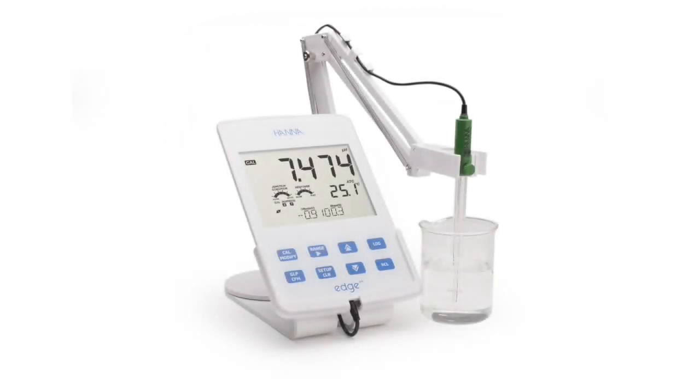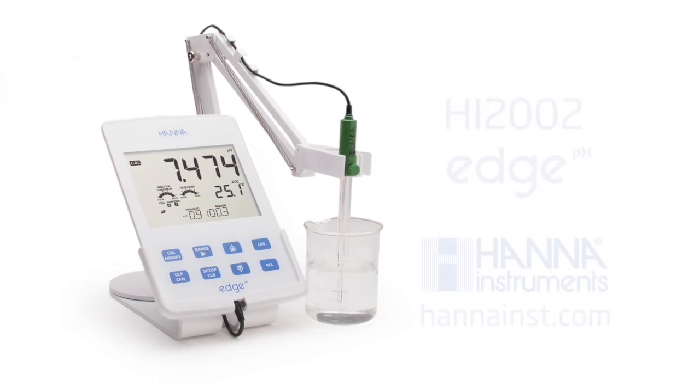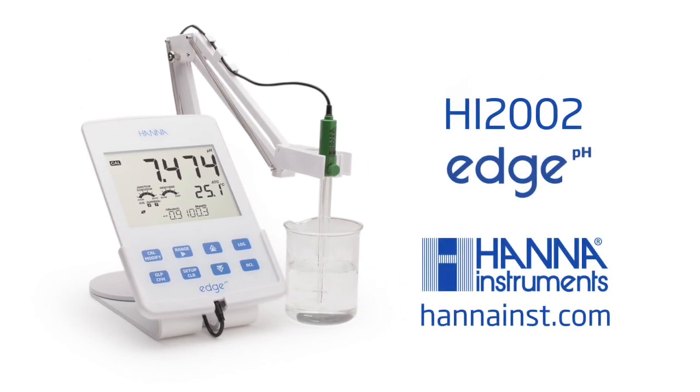The HI2002 is an excellent choice for the customer who is looking for a high performance meter while maintaining the low profile and mobility of a portable meter. For more information about this or any of our other products, please visit our website.